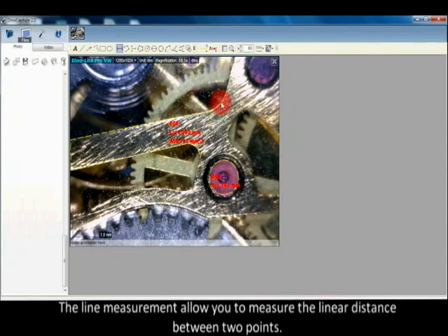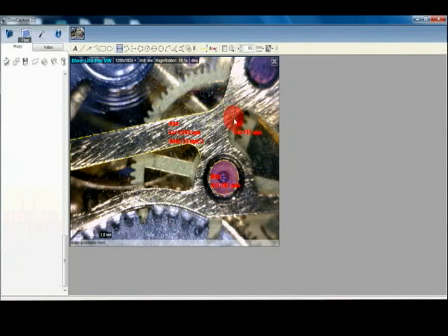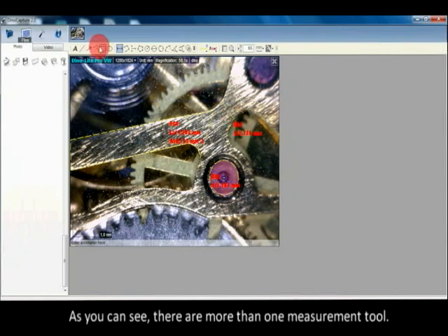The line measurement allows you to measure the linear distance between two points. As you can see, there are more than one measurement tool available.